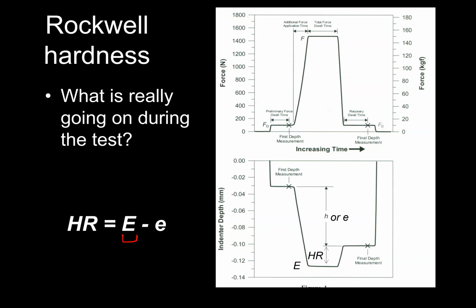Now, an important factor in this test is going to be the time that you allow the specimen to relax during the application of the load. So if this time is too short, you may not achieve maximum penetration. So there needs to be a minimum dwell time when you impose the load. Okay? And so this test, unfortunately, because of this dwell time, is relatively time consuming.